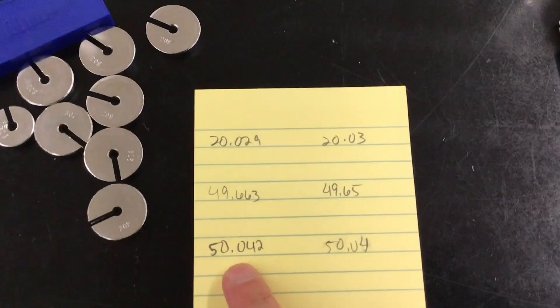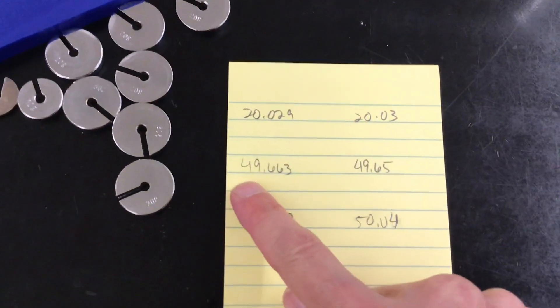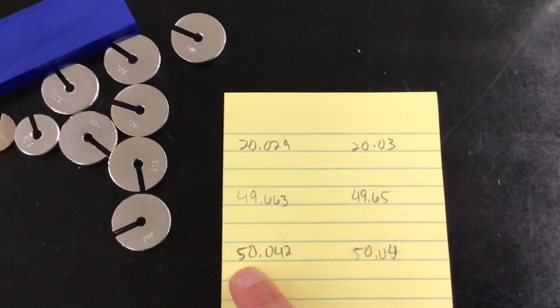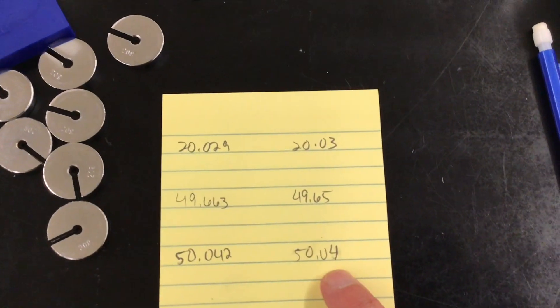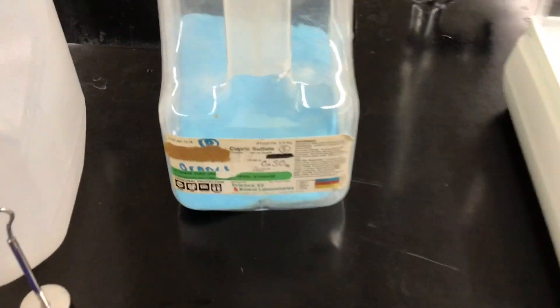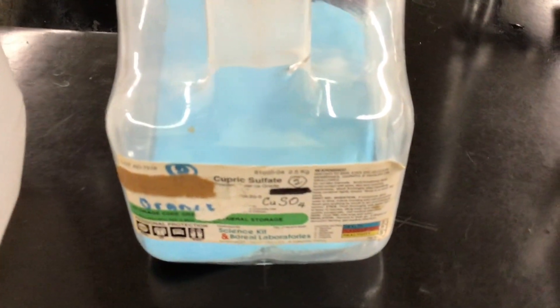Writing down 50.04. Here is some comparison data: the milligram balance reads 20.029 versus 20.03, 49.663 versus 49.65, and 50.042 versus 50.04. That's just some test data we are about to use in Chem 1.